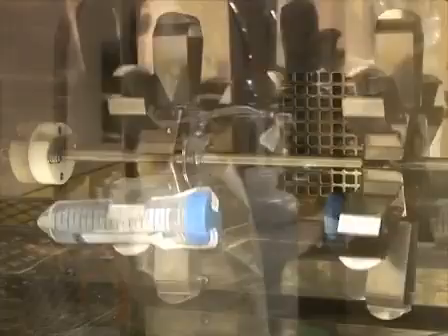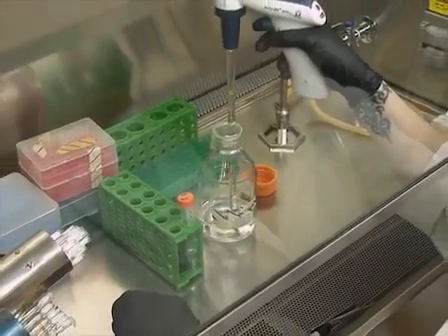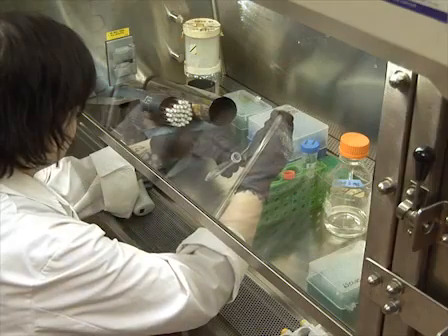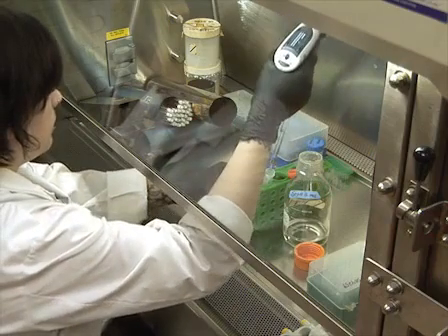Place the tube in a rotating oven set to 37 degrees and let digestion take place for 45 minutes to an hour. Once digestion is complete, add 10 milliliters of sterile tissue culture PBS to stop the enzymatic reaction and spin the cells down at 300 times G for 5 minutes. Remove the supernatant and resuspend the pellet in 5 milliliters of PBS.